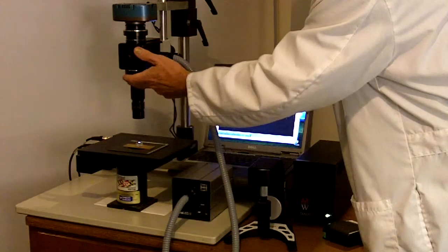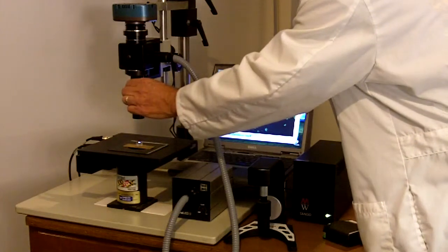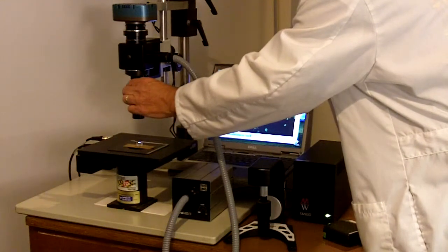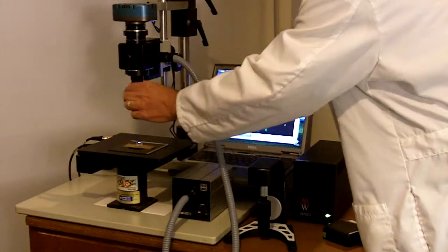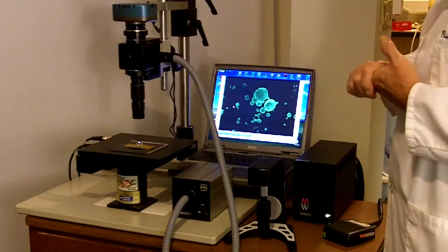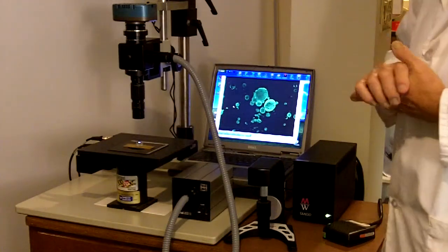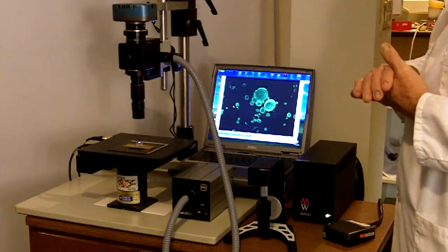And that's a very important feature that you don't find on most stereoscopic microscopes being adapted for fluorescence microscopy. So think of this as a single optical channel made in America compound microscope system with infinity corrected optical channel.